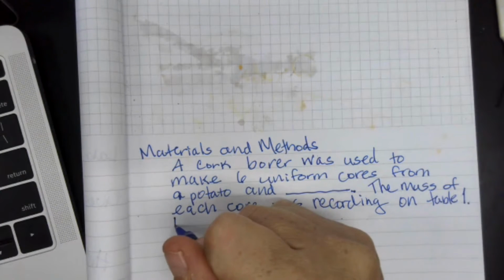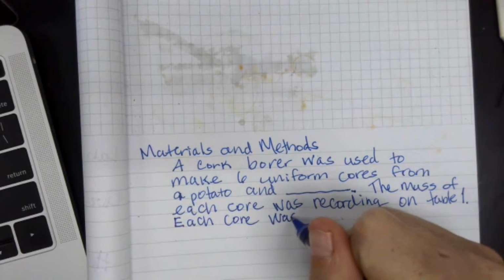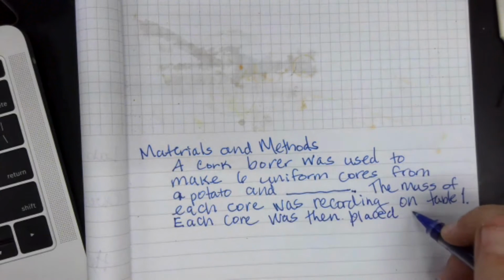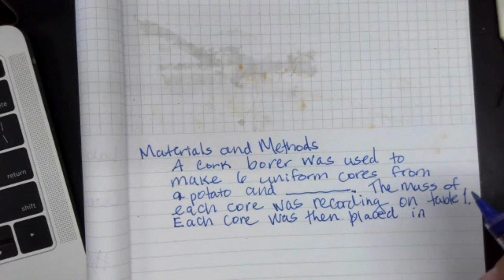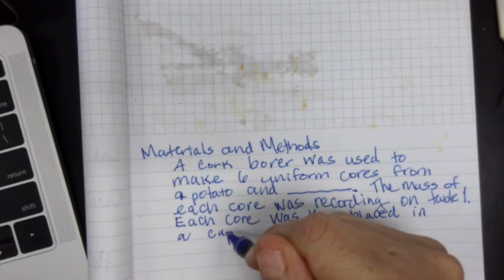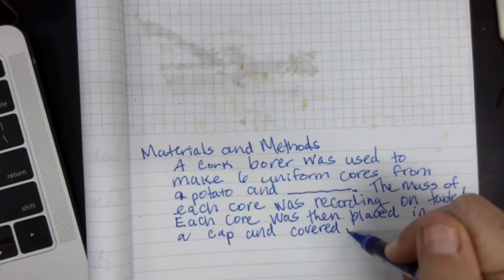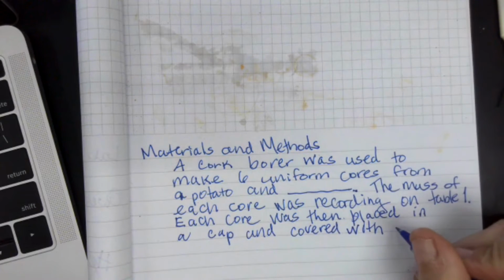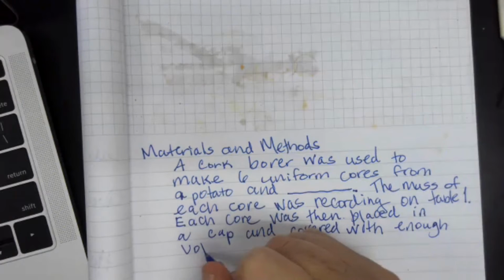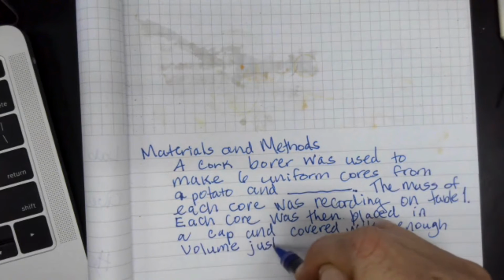Each core was then placed in a cup and covered with enough volume, just enough to cover the cores.